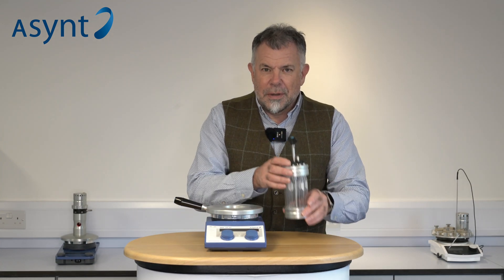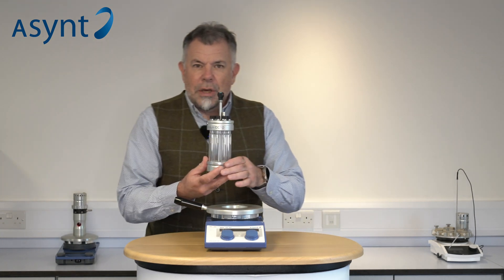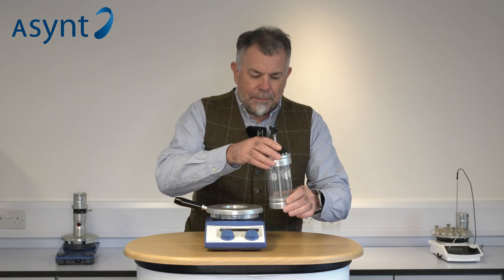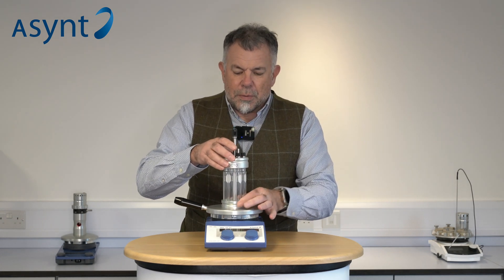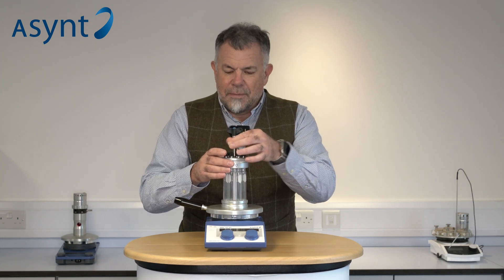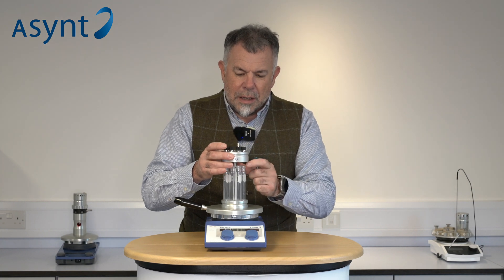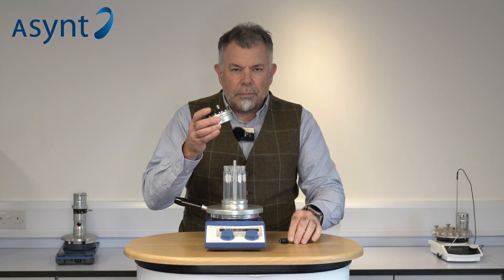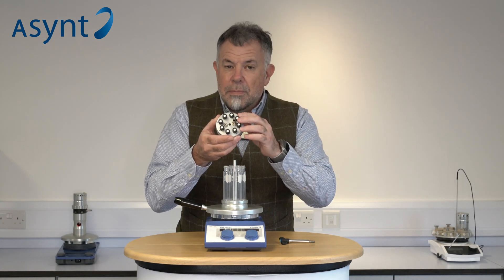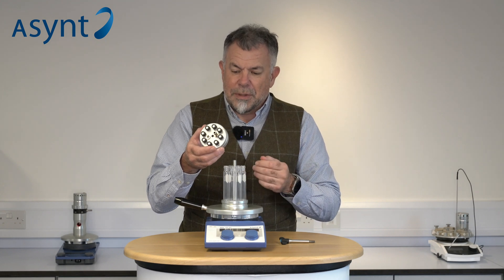Let's first start with a product we've had for some time now. This is the Octo. It's an eight-position parallel reactor and it sits quite simply on top of a standard hot plate stirrer — very, very simple to use. We have an inert atmosphere, a sealed head that seals on all eight tubes, and septums for each position so you can make additions and take samples under inert atmosphere.